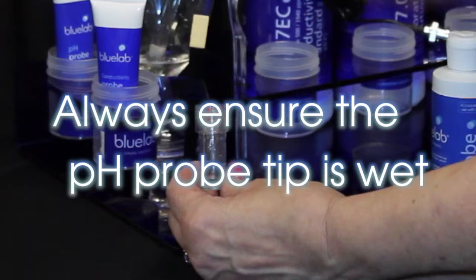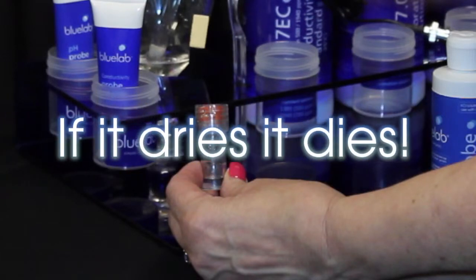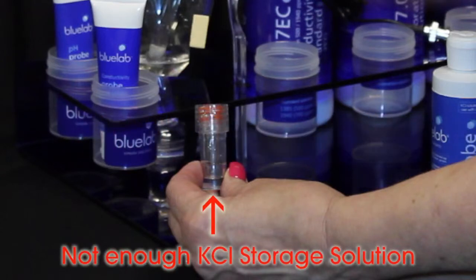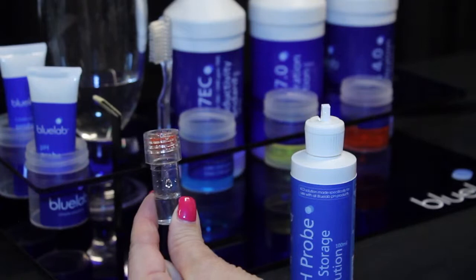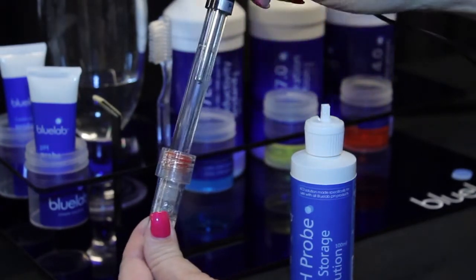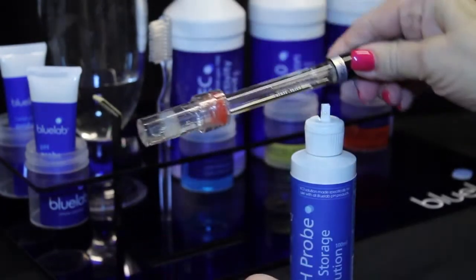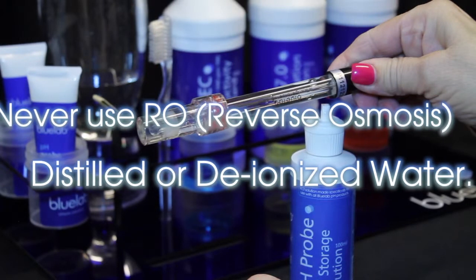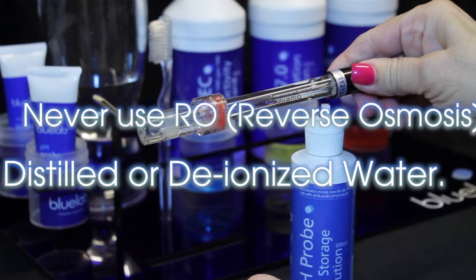To store the pH probe when not in use, always ensure the pH probe tip is wet. If it dries, check there is enough Bluelab pH probe KCL storage solution in the cap to cover the probe tip. If not, add KCL solution to ensure the probe tip will be covered. Place the cap back on the probe and twist the top counter clockwise to secure. Always store the pH probe in KCL storage solution — never use RO, distilled, or deionized water. Pure water changes the chemistry in the probe, causing the probe to die.